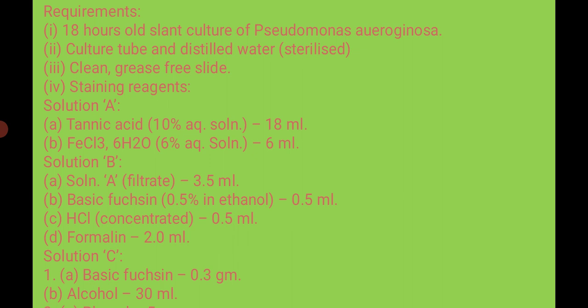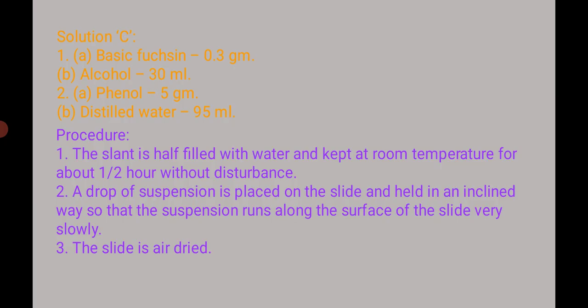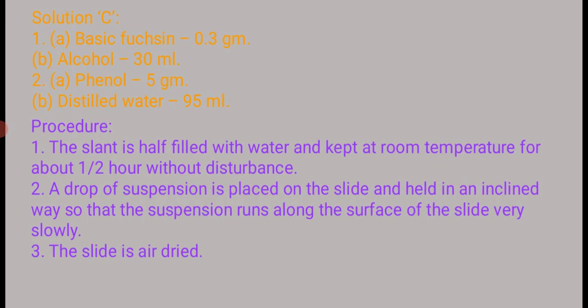Whereas solution C is also called ZNCF, that is Ziehl-Neelsen carbol fuchsin, and it is made up of basic fuchsin, alcohol, phenol, and distilled water. So these three solutions are used for the flagella staining procedure.